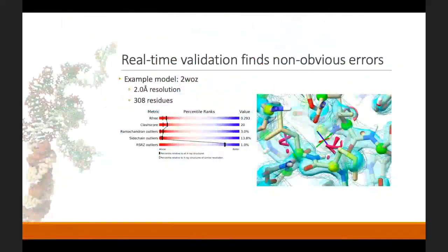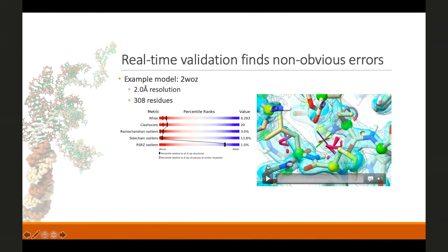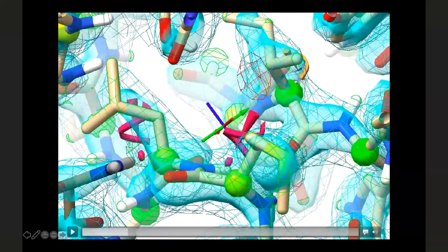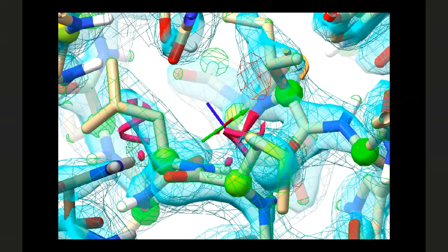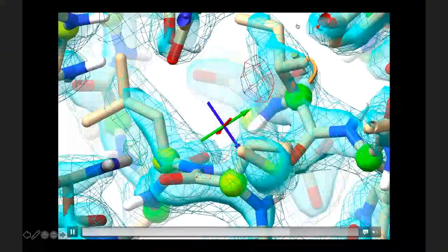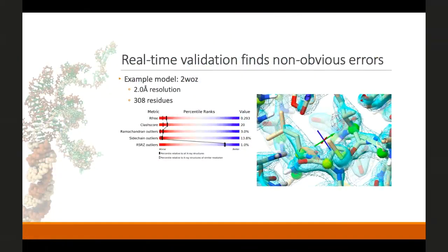One of the big advantages of real-time validation — which surprised me when I added it, particularly the rotamer validation — is that it finds many problems that by eye I would have simply gone straight past. Here we have three sidechains that each look fairly well modelled into the density and don't look obviously wrong, yet the MolProbity validation contours based on many tens of thousands of residues say clearly that each is in a very low probability conformation. Going through each in turn, we dial up a better conformation, and those are fixed. That's literally as fast as it goes.